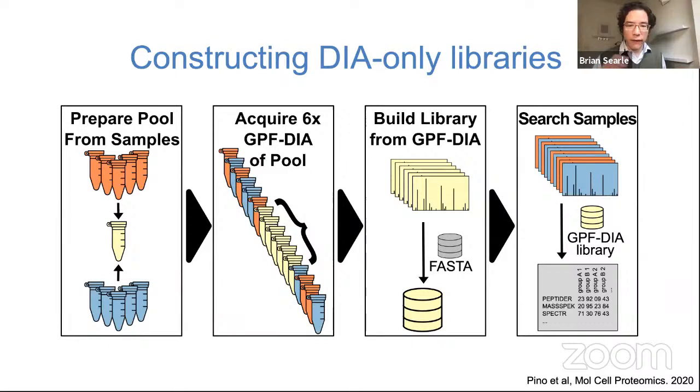So here for retention time alignment, we're at the point now where you don't really even need to consider adding spiked-in peptides into your samples, unless you, for some reason, need to monitor those types of peptides for another type of reason. So again, these types of peptides you don't even need to necessarily include them.